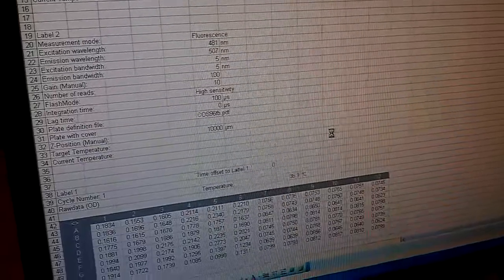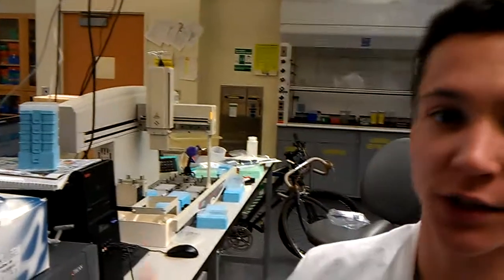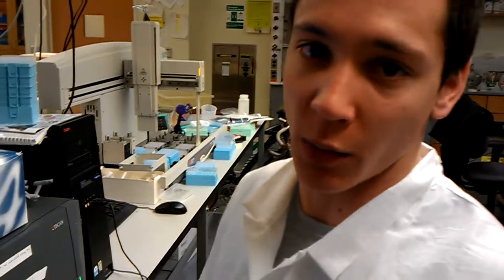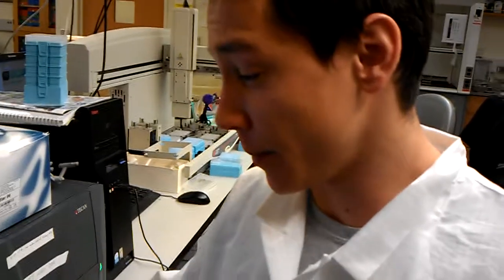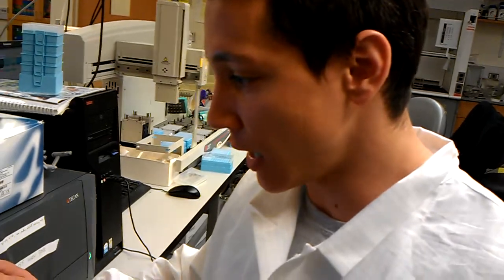As a matter of fact, you should always wait around for a couple of minutes after you set up your time course to make sure no weird menus come up, to make sure that nothing strange happens. So if it does, you don't want to just go home, come back the next morning, and see your entire experiment has just failed because you didn't wait around for 3 minutes. So this should be fine. You can hear it making its noise.